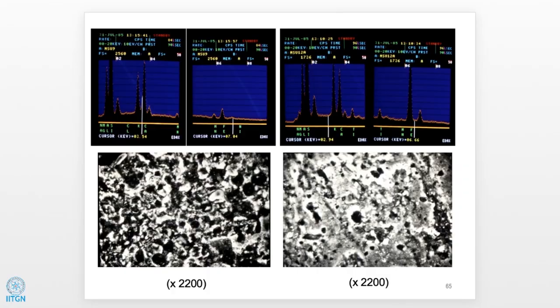When I started analyzing, I did not get manganese as a major element. I was getting iron. So I tried different methods. I did wet chemical analysis, then EDX and scanning electron microscopy. While doing energy dispersive X-ray analysis, this is how it was coming: sodium, magnesium, aluminum, silica, chlorine, potassium, calcium, manganese, whose peak is very small, and iron. This one is sample number 9, and this is another sample, 12A. This particular sample is of the body, and this is of the pigmented region. Here you have iron, and manganese is very less. Then it was very difficult.